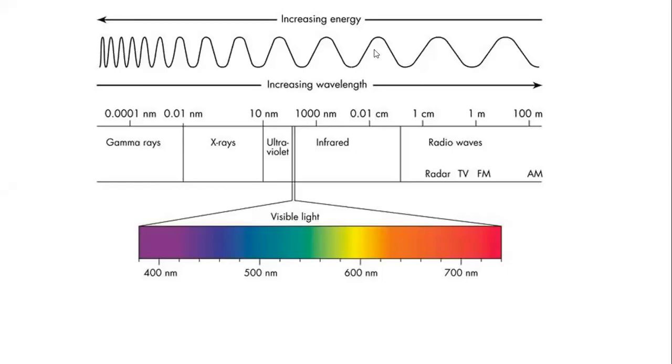What it does is it excites the electron, and the electron goes to the next electronic energy level, while you lose one light radiation passing through. And if you can find out by checking how many light radiations were striking that and how many are coming out, then you can actually judge and find out how many atoms must be interacting with the light radiation. That is one part of the story. It's quite a rare event.